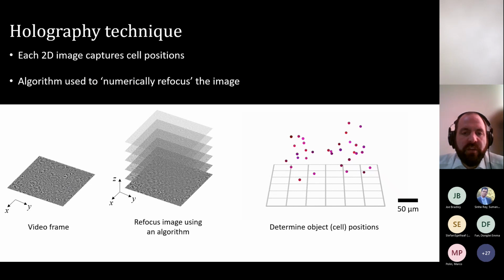So this is the technique that we use to reconstruct the sample volume. At the bottom left-hand corner, I've got an example of the image that I showed earlier on, and it's got these ripple patterns caused by bacteria that were swimming around in a liquid sample. And these could equally be colloids or anything else. It doesn't have to be bacterial samples. David Grier's group at NYU, as I said, started a lot of this work looking at characterizing colloidal particles, but I'm interested in tracking bacterial cells.